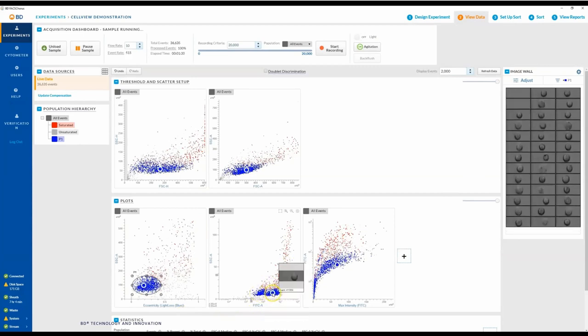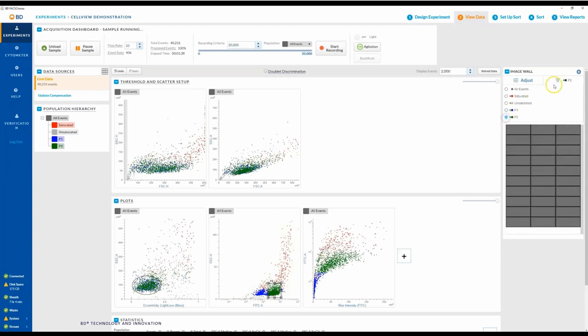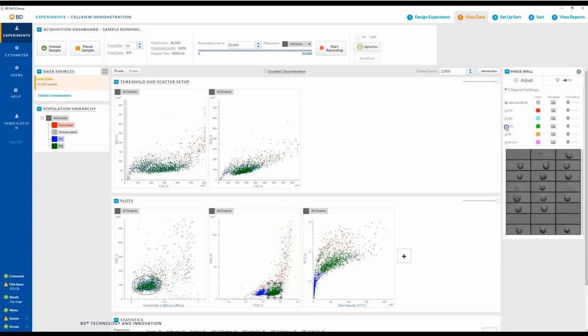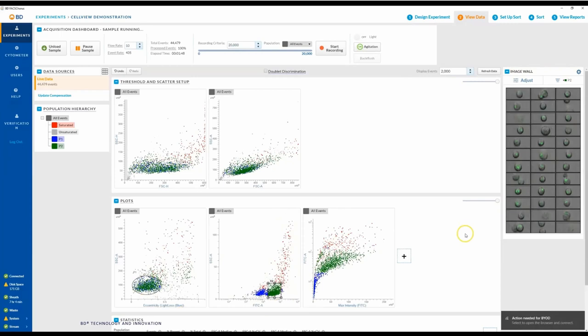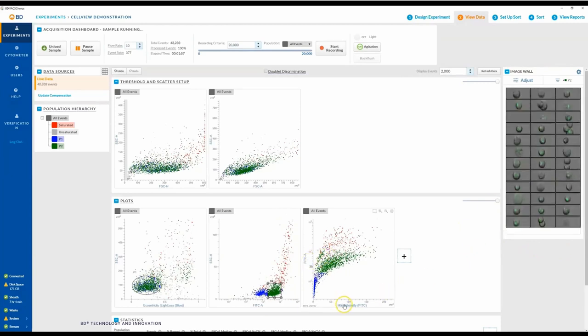If you take a look at the second plot, you can see I've plotted the FITC area on the x-axis. If I grab just the FITC positives, and I switch the wall over to the FITC positives, we should be able to see that most of these cells consist of punctate spots of fluorescence, meaning all the fluorescence is concentrated in just a small region of the cell. However, occasionally, you may be able to see that there are some cells that have diffuse fluorescence, meaning the expression is spread throughout the cell.